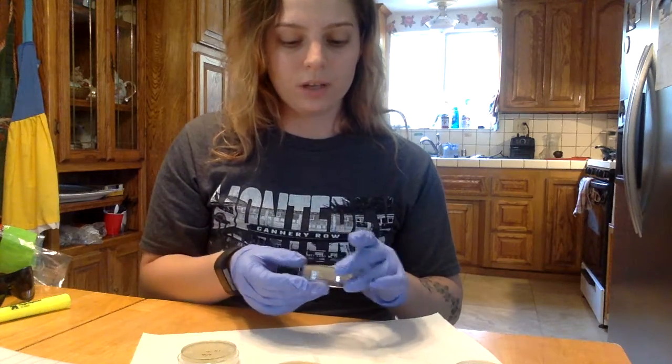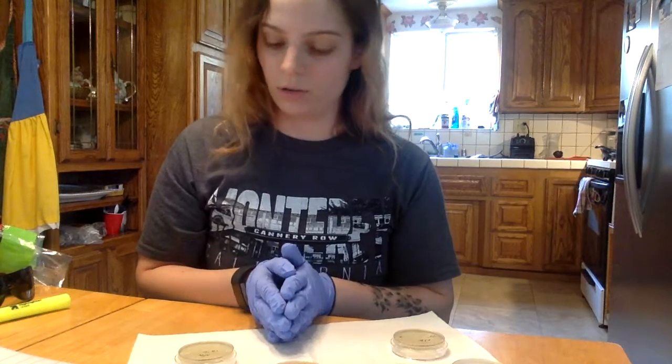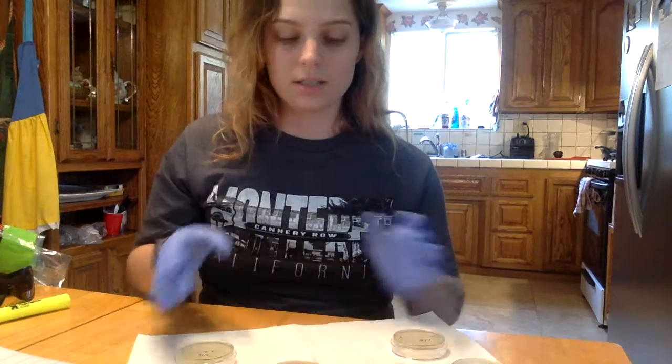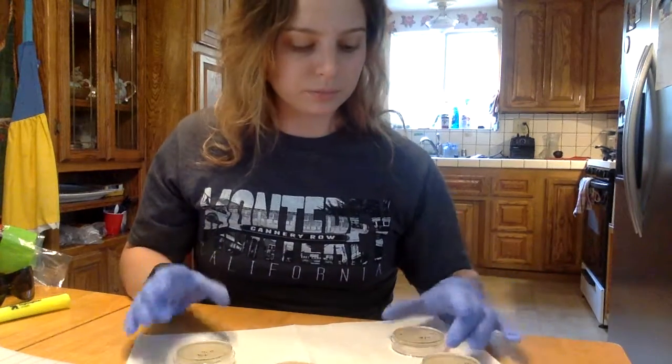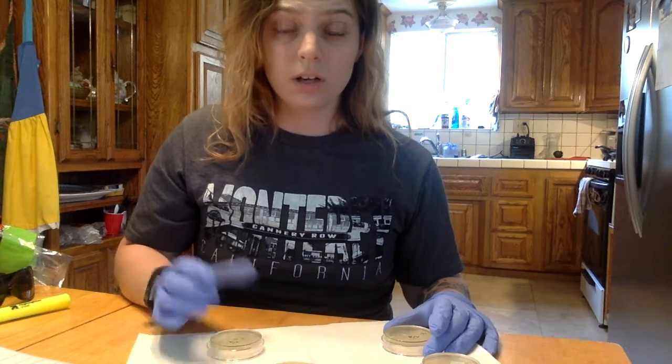And on Friday I checked, that was the 48-hour period mark, and I wasn't happy with the growth results. Checked on Saturday, wasn't happy. Today's Sunday, the last day, I decided to evaluate what has happened. So with each plate, there's very little colony growth.